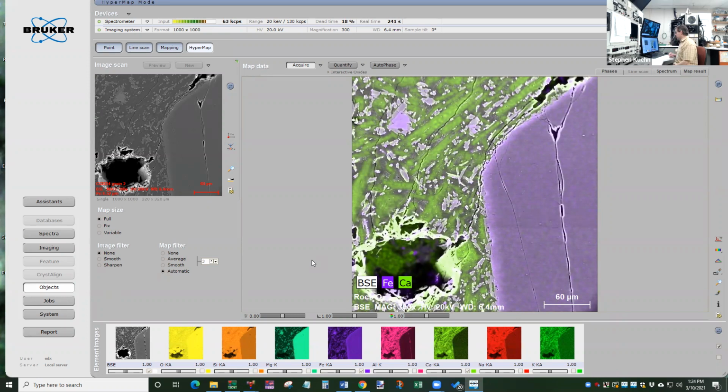So this is kind of one of those places where geology and art can meet up, because you're taking the natural chemistry of the rock and minerals that are in it, and the texture of the rock, like the sizes and shapes of the crystals, and then you can actually change the colors. So I could make the iron be dark blue instead of purple, and you can mix and match this and make something that might be considered art out of this.